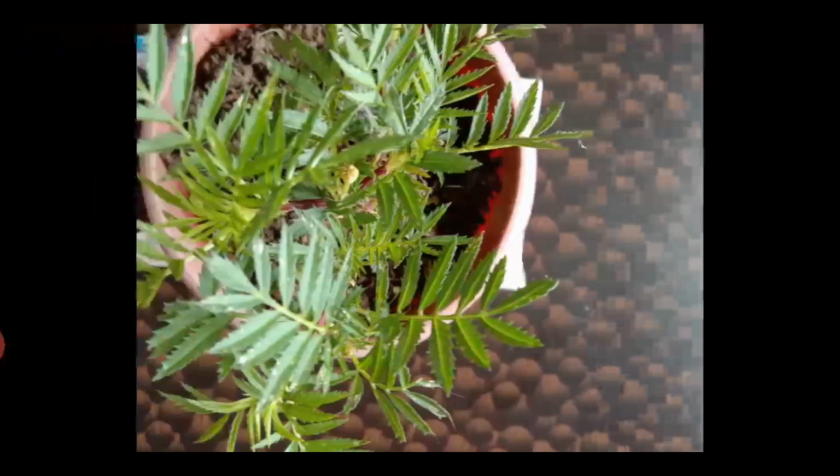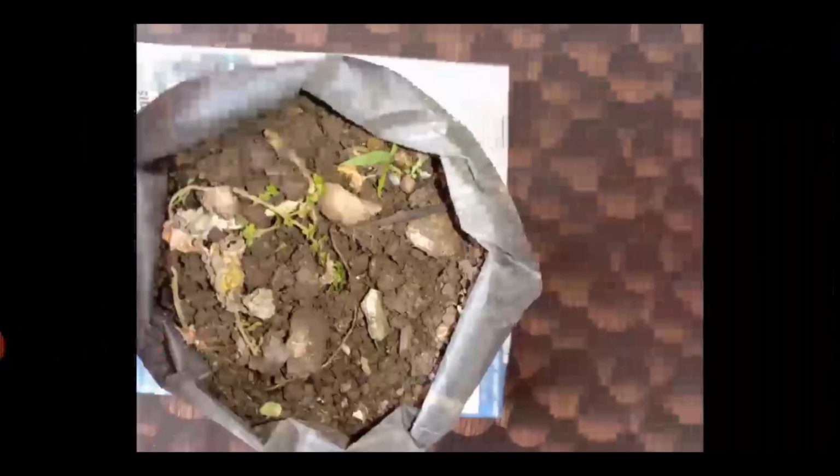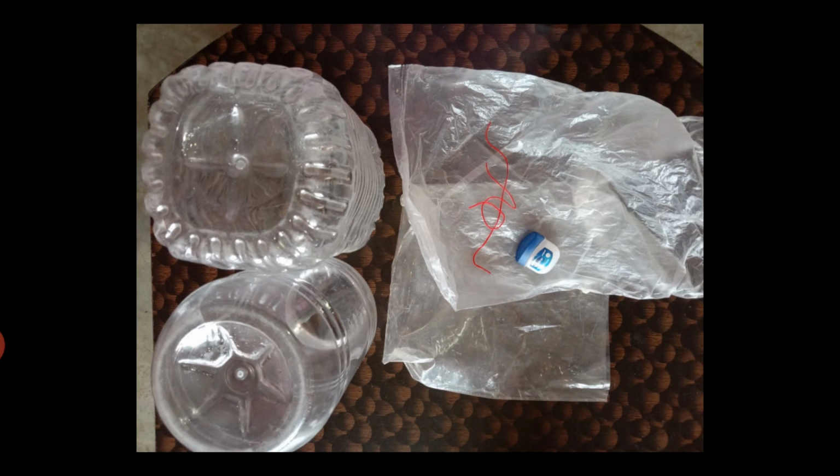Another one is a pot with just soil, no plants. Then 2 bell jars; I've taken 2 plastic jars there. 2 large polythene bags, and thread and Vaseline, you can see there.